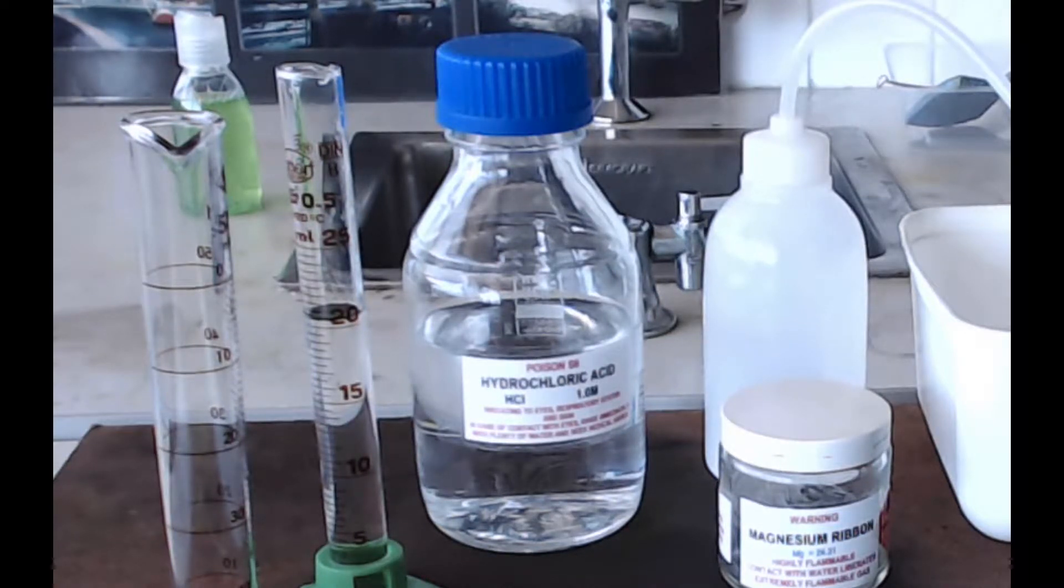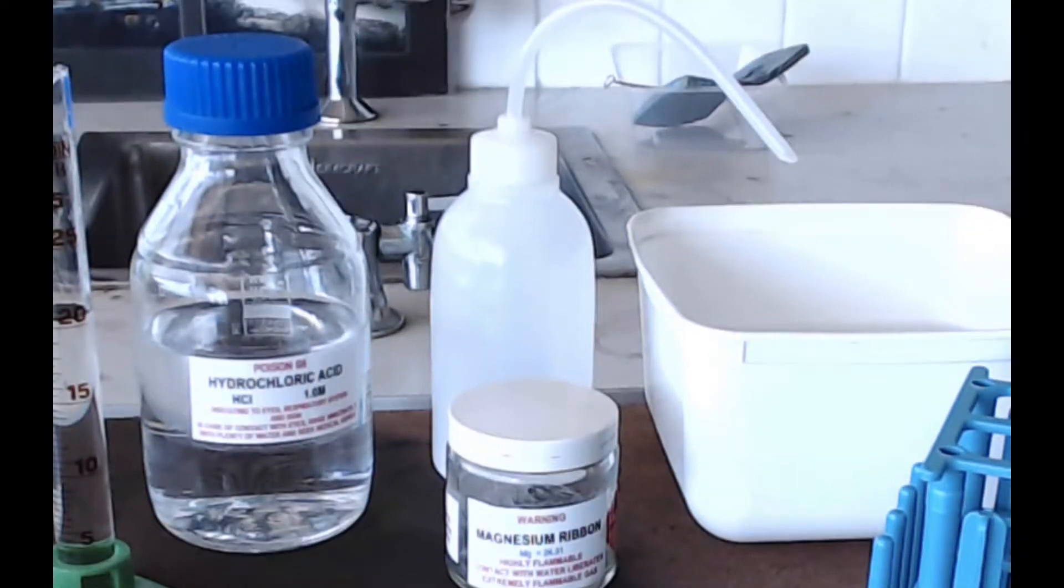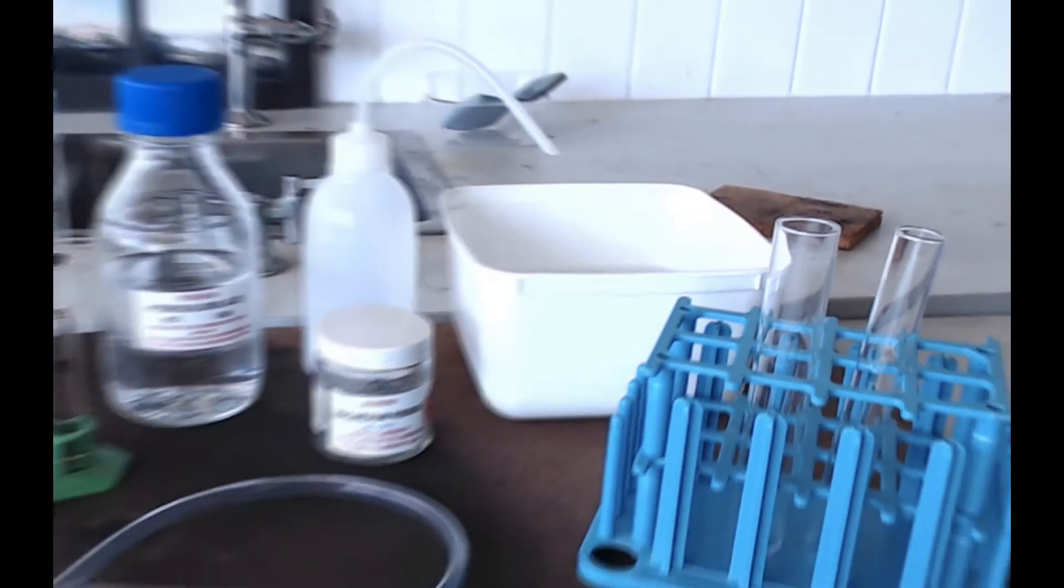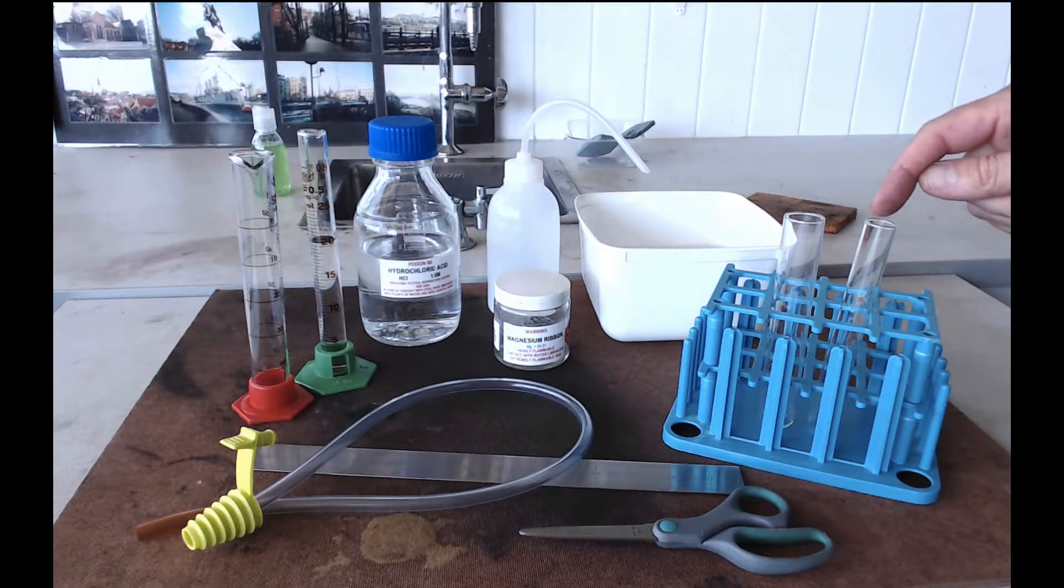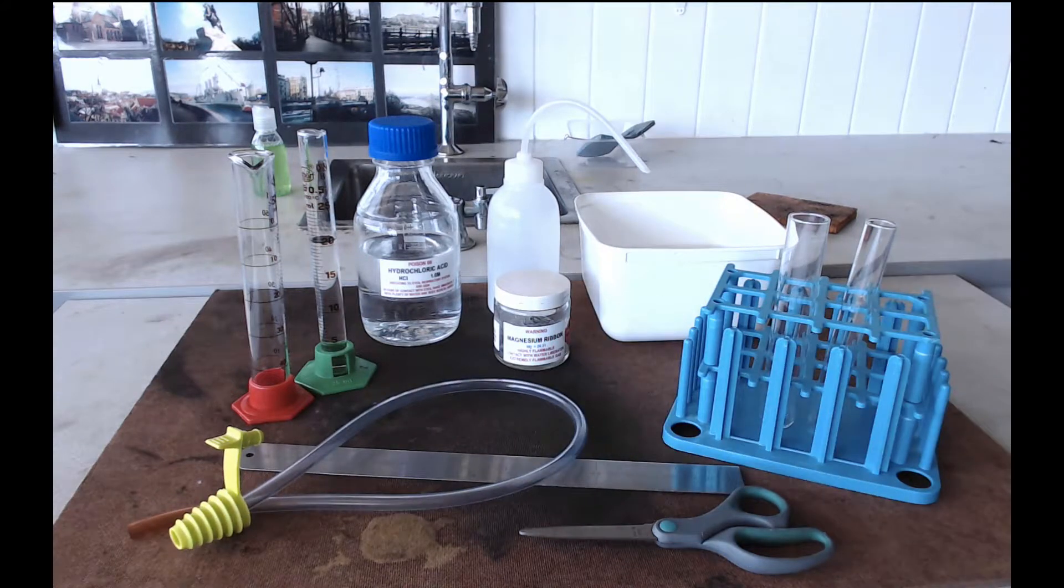You're going to need 4cm pieces of magnesium ribbon. These might have been cut for you or if not you're going to need a ruler and a pair of scissors and you can cut it yourself. You're going to need some distilled water. You're going to need an ice cream tub full of tap water, well not full of tap water but about half full. You're going to need a boiling tube, that's one of these larger tubes here, and a small test tube, that's one of these narrower ones here. And finally a delivery tube, that's this thing, and that's going to be for getting the gas from one of these tubes to the other.